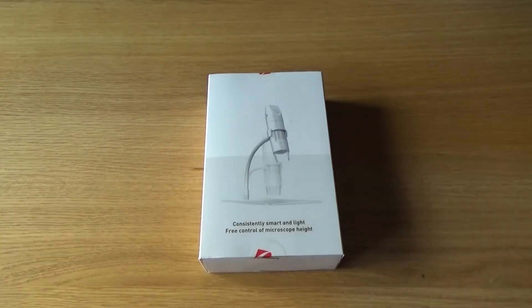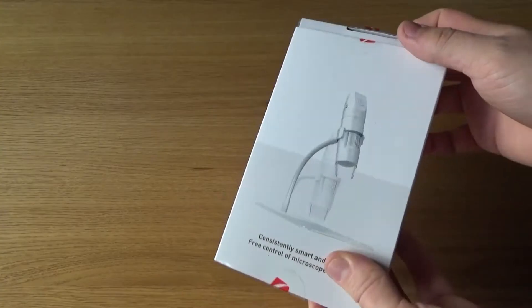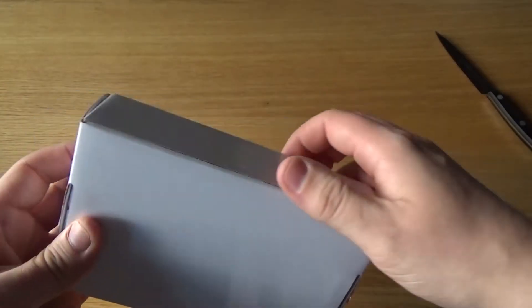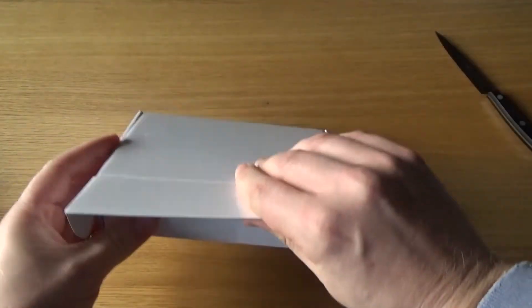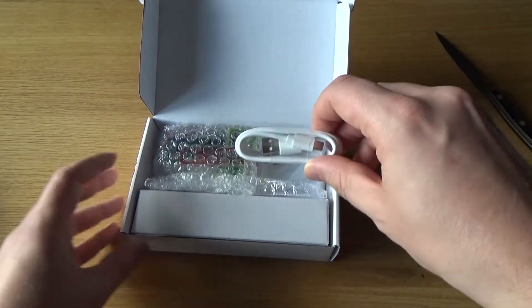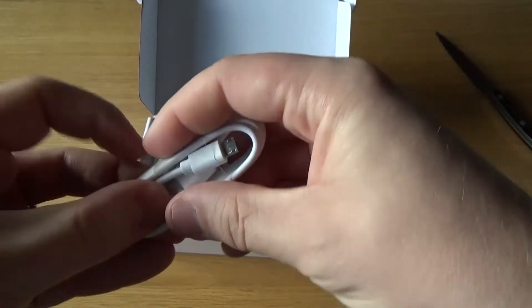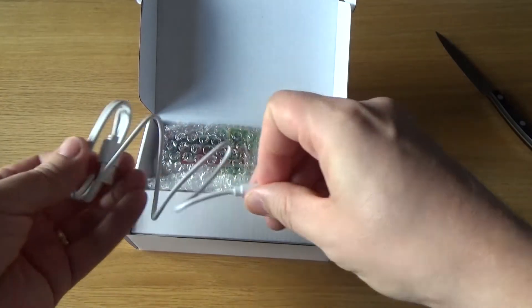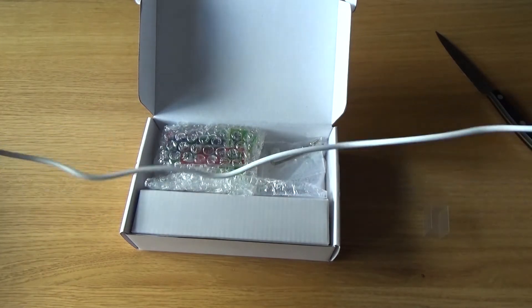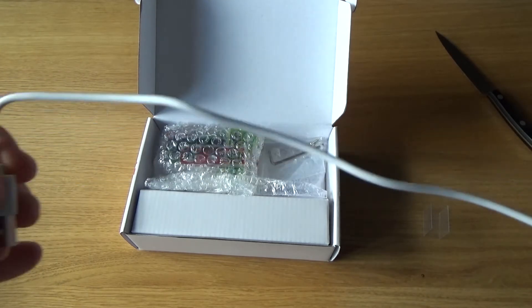So enough talk about the box — let's open it up and see what's inside. It comes sealed on all four sides, and you notice it's not actually the box, it's just a sleeve around it. The little box inside reveals all the goodness of this microscope. It comes with a little cable — that is the connector cable that allows you to charge the microscope and also hook it up to a computer in case you want to use it in wired mode. It's maybe 40 to 50 centimeters, so not very long.